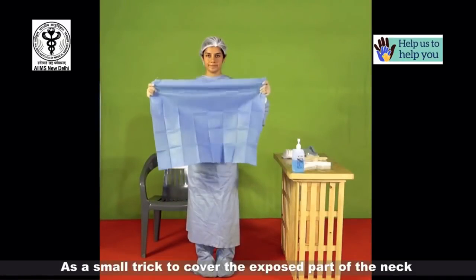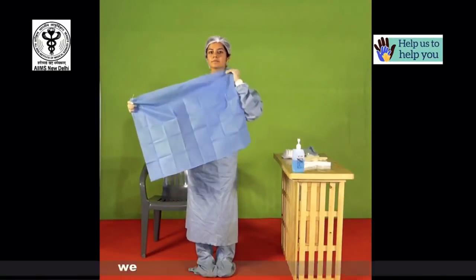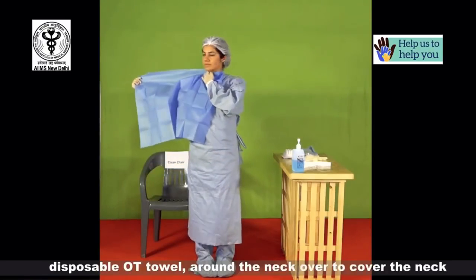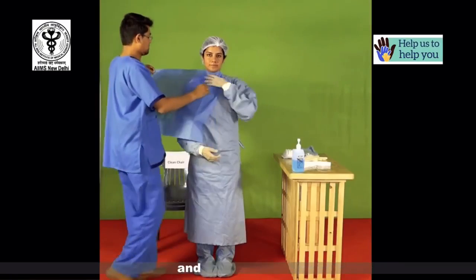As a small trick to cover the exposed part of your neck, we suggest wearing an impermeable disposable OT towel around the neck to cover the neck and the shoulders.